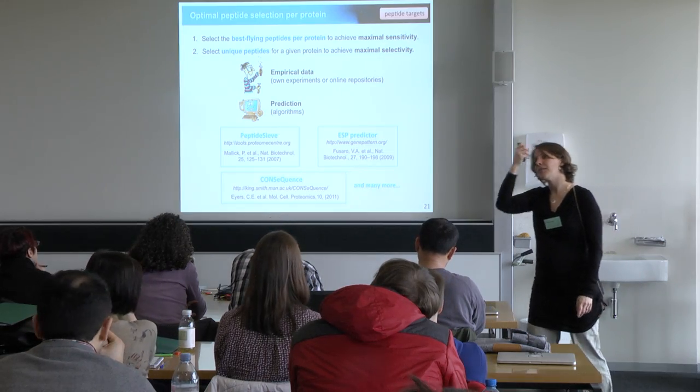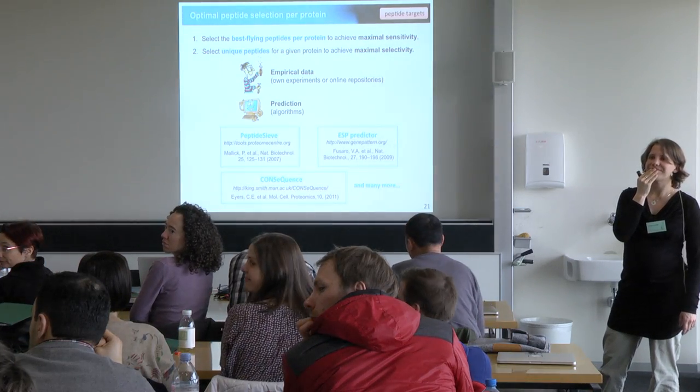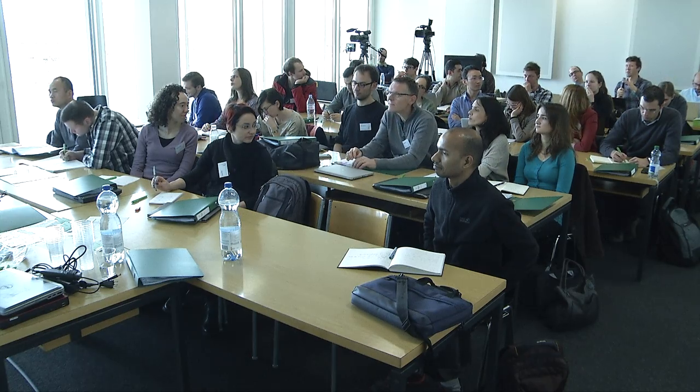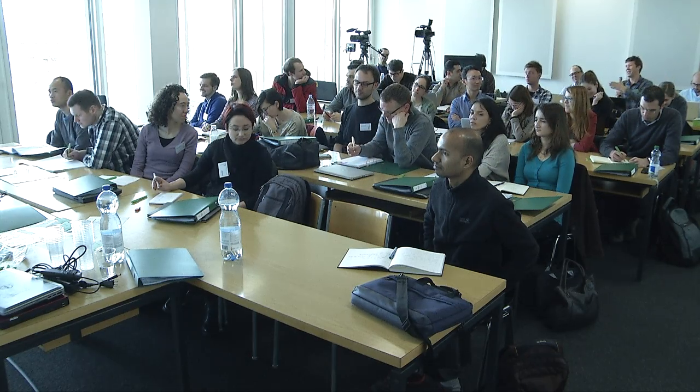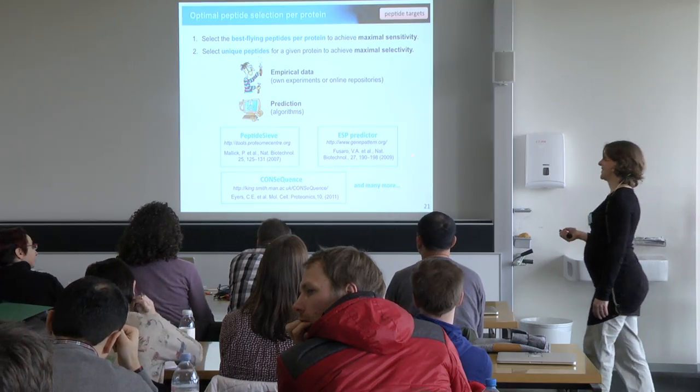Yeah, Brandon? There's a new one out from the Maccoss lab that's actually an external tool to Skyline now, and a lot of research from Brian Searle. I think there's a published paper showing that these other ones really do not work very well at all, close to random guessing, basically. His is slightly better than random guessing, but basically, yeah, empirical data is definitely better. So there's a 4th one to add. Called Prego. Prego, okay.